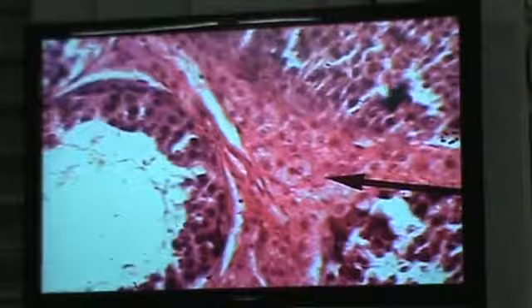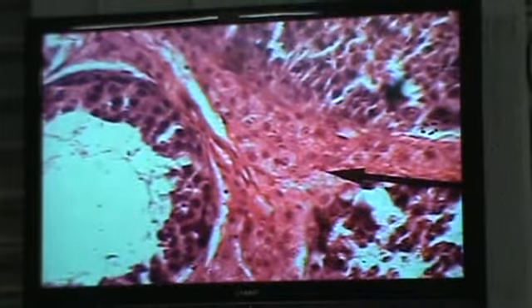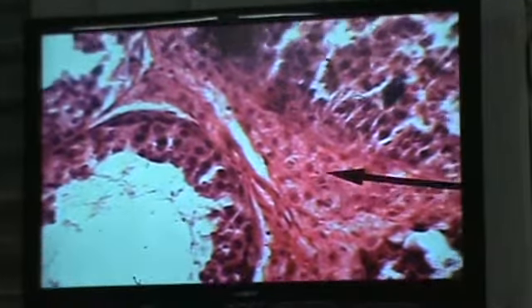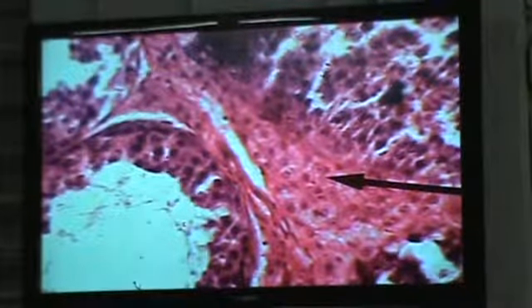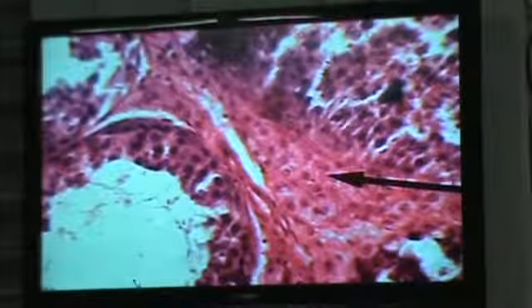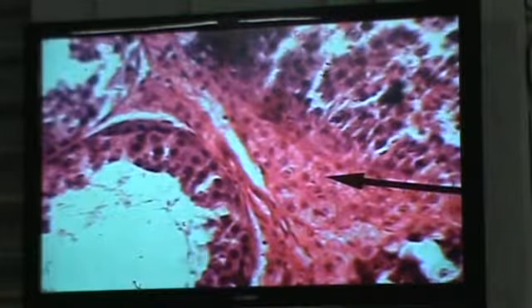We're looking in between, say, the seminiferous tubules. Yeah, there's one in between the tubules, maybe four with one in the corner there. But there we can see a number of interstitial cells. Now, just to tell you, and then we'll take a 2 minute break, and come back and do spermatozoa and prostate. But just to tell you that, I have done some work on marijuana. I have worked on ganja seeds. Very good.